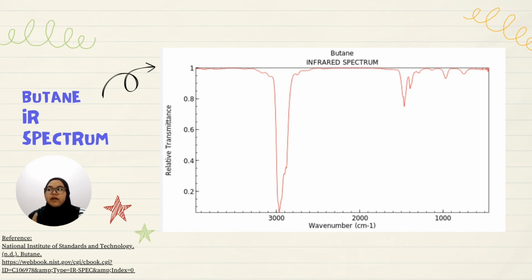The peaks of infrared are all determined by the strength of the intermolecular interaction. When the strength of the intermolecular interaction changes, it can cause the width of the peak to differ. As we can see in the graph, there is a small one, the smallest one, and the big one. So the difference of peak width will be used to distinguish the functional group.